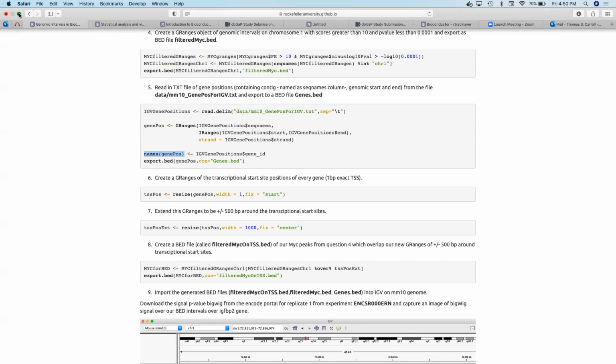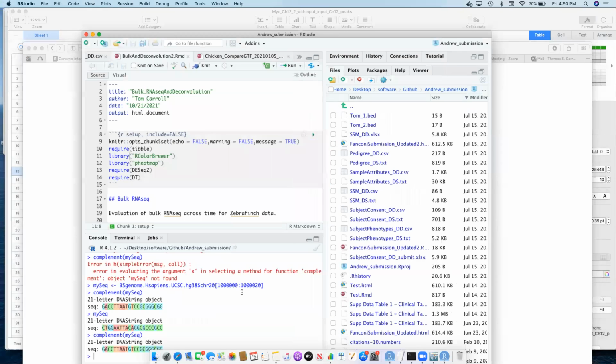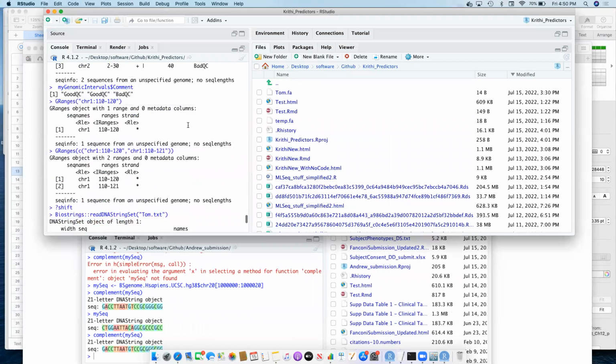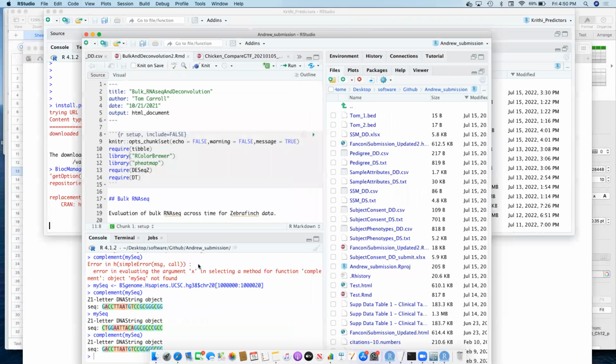So someone raised a question in class here, which was a good one: what happens if we just set names within here rather than assigning names afterwards? Actually, I'm not sure if we still have the solution up from when we were talking about it earlier. Let's look. Maybe not. Maybe in here. Oh, here we go. Maybe it wasn't here. Okay, but we can just do it again very quickly.